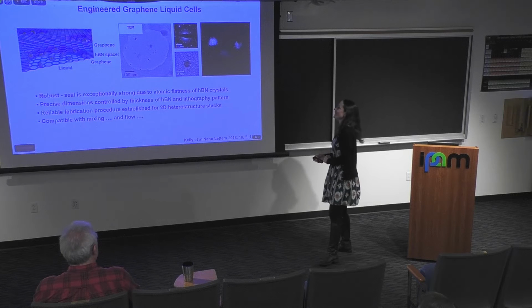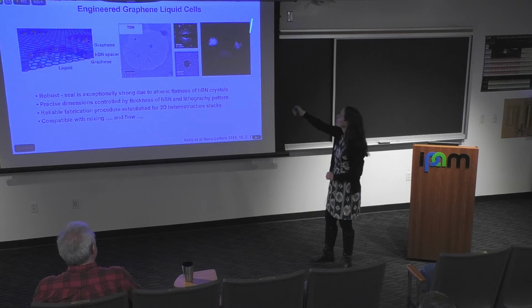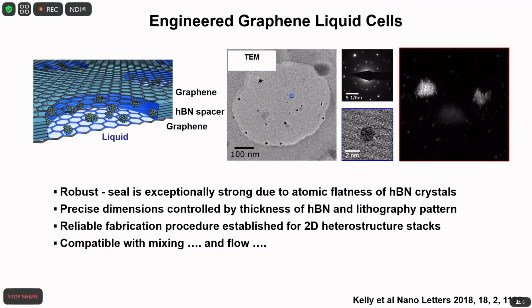Oh, great. Okay, so you've got your Tupperware, and indeed, when you have a Tupperware, you can see the position of the individual atoms. This is a platinum salt within the graphene liquid cell. You can see that this is the size of the cell, but it's lithography. You can choose whatever size this cell is. The filling is better when you have smaller cells. If you start to make your cells tens of microns in size, you end up with them filled around the edges and the graphene sheets stick together in the middle.